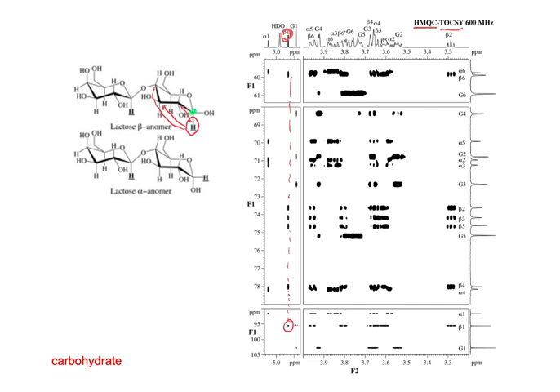that carbon to all of the protons. Right? So if we go across here, we're going from a carbon to the protons. We're seeing all of the protons.